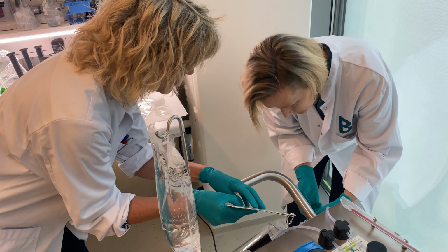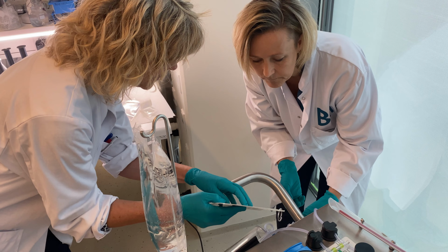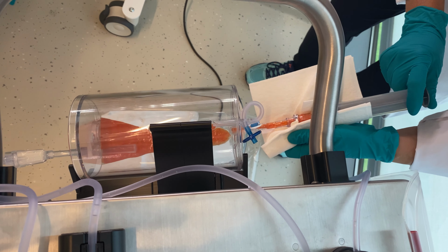The project was prolonged due to corona restrictions that made it difficult to meet physically, but it also made it impossible to get the fat tissue that is a necessity for the project. The consortium group has held meetings and taken decisions that makes it possible to finish the project within the timeline and the budget. Towards the end of the project, the group has tested the demonstrator several times, and even though we had made the requirement specifications, there were still some adjustments that needed to be made.